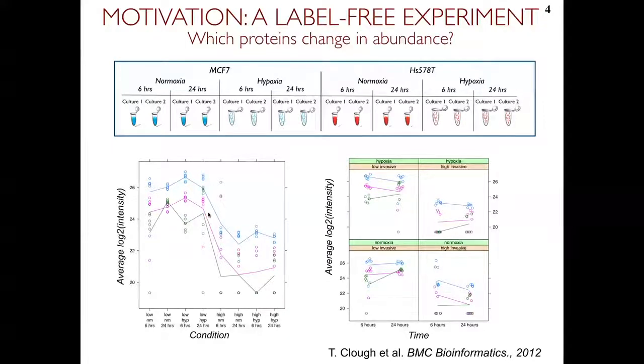And so the original motivation of our work was to come up with statistical methods which will take as input the output of data processing tools such as Skyline or DIA-Umpire or anything else, and develop statistical frameworks which can work with complex designs such as this one, handle outliers, handle missing values, handle complex comparisons, and provide approaches which are repeatable, in the sense that there are scripts which you can repeat and you will get the same numbers, but hopefully also reproducible, meaning that they don't depend on the choice of the data processing tools too much. And that was the original motivation.